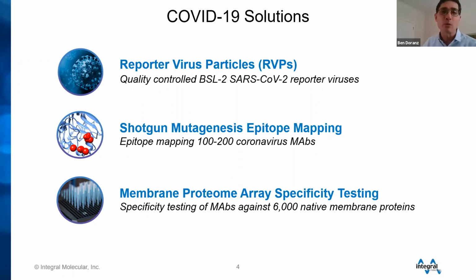I'll talk mostly about the reporter virus particles today, which is, I think, why most people are here and probably what will be of most use to people. But we also offer a number of other things that are related to the RVPs that I'll mention throughout.